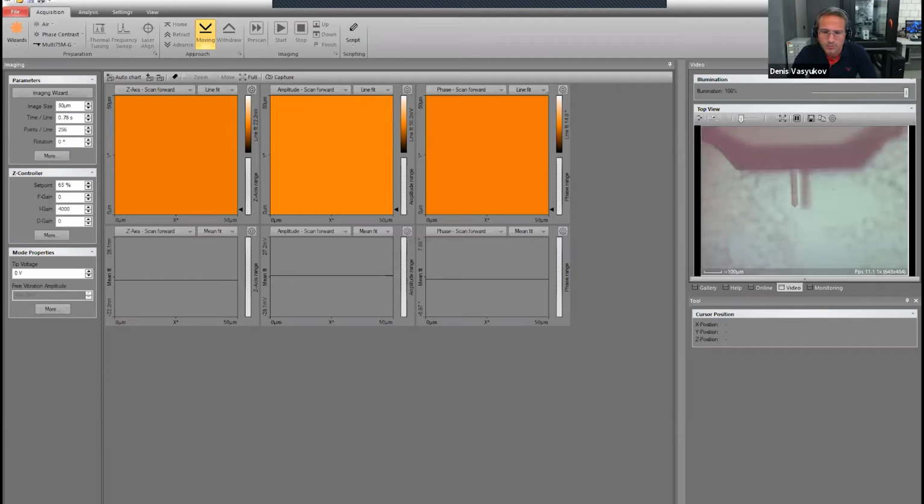Okay, here you can see the system is moving. So the Z stage is moving. You can see it at the bottom on the left, there's a green progress bar. And on the right, you can see the distance between the shadow and the cantilever is getting smaller. And they're almost overlapping. And when the cantilever is sensing the surface, it means that the approach is done. Okay, so the approach is done, and the first thing we should do is see what kind of topography we have. I already looked at it, but okay, let's do it together.